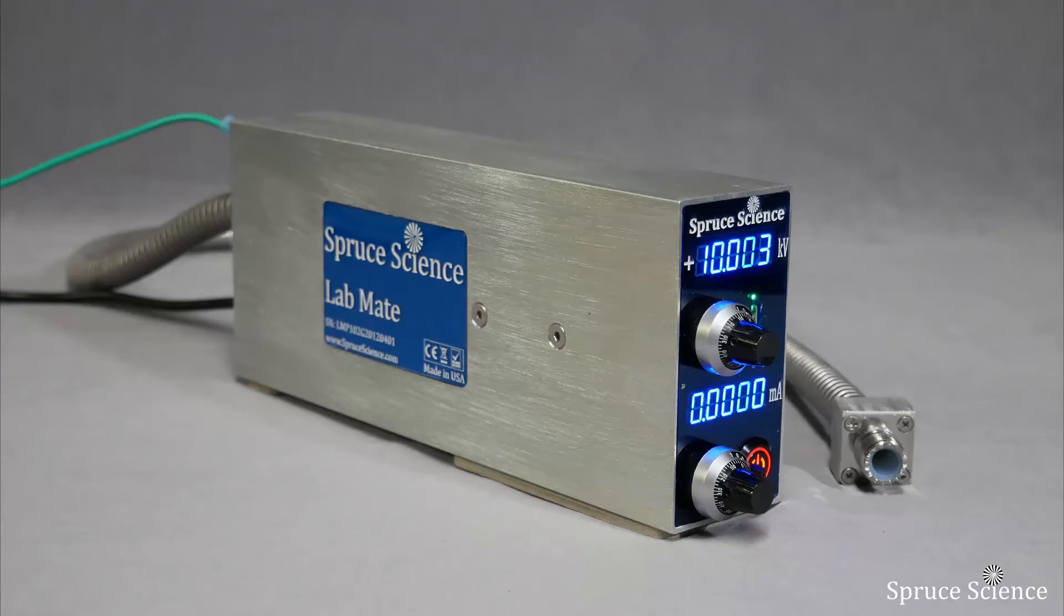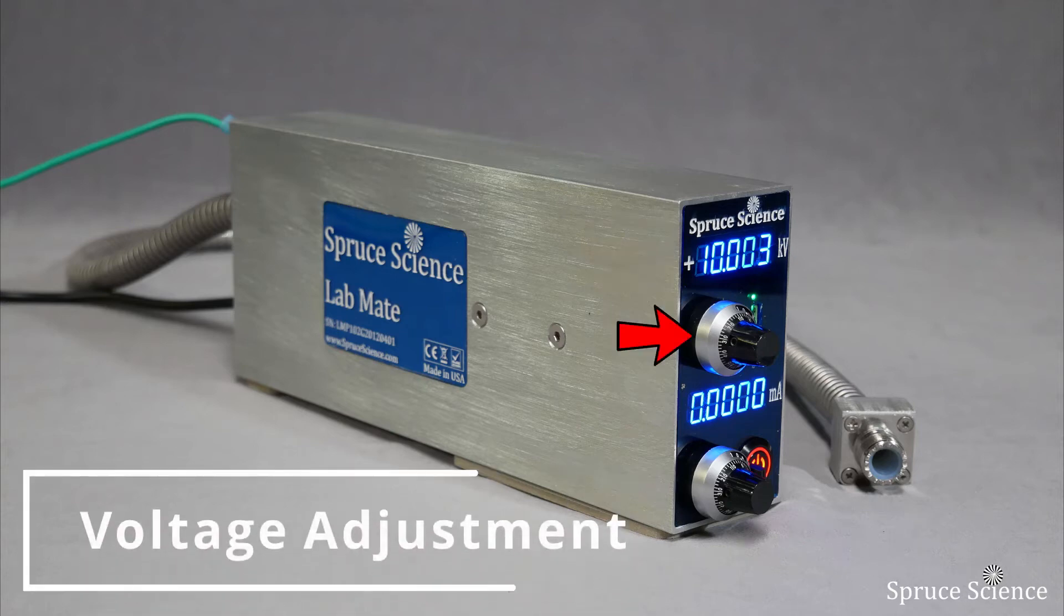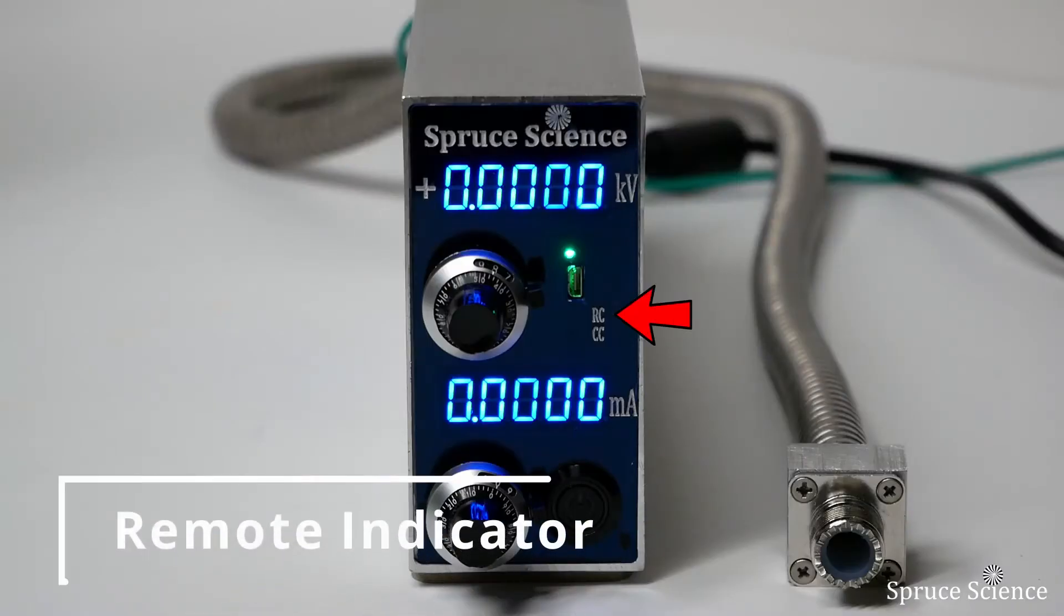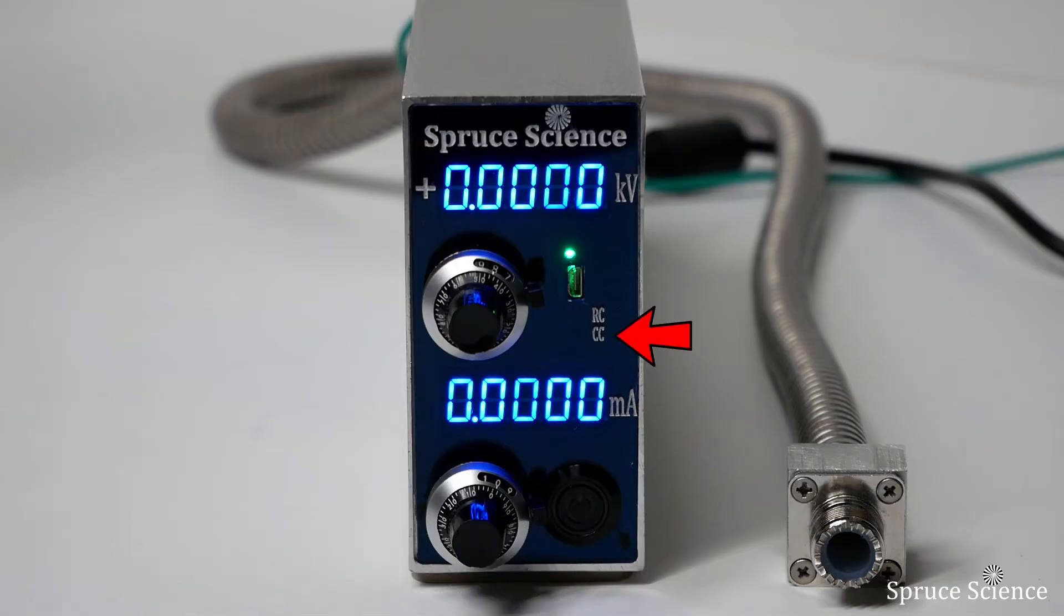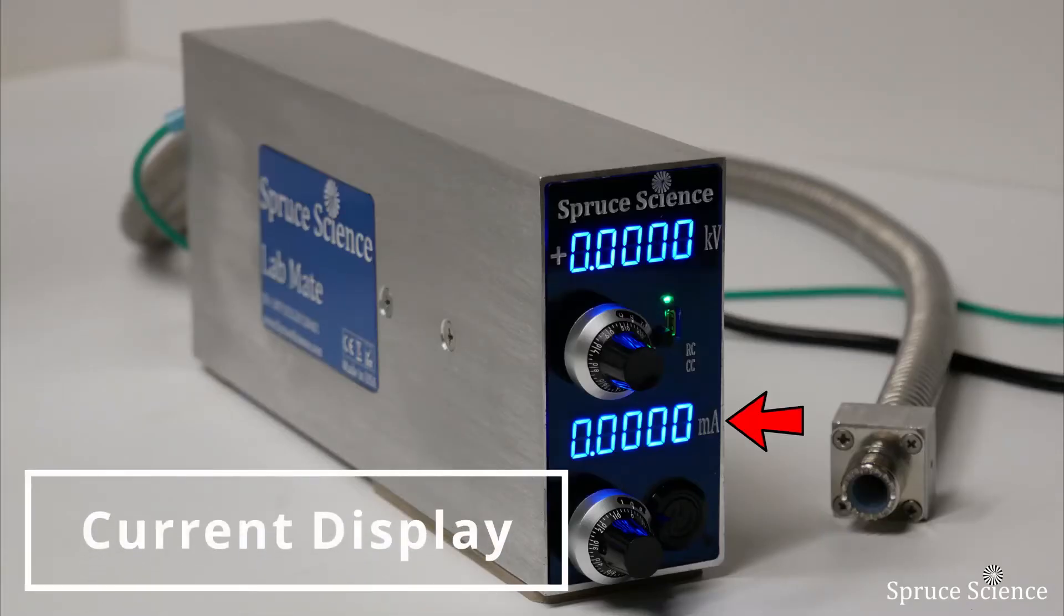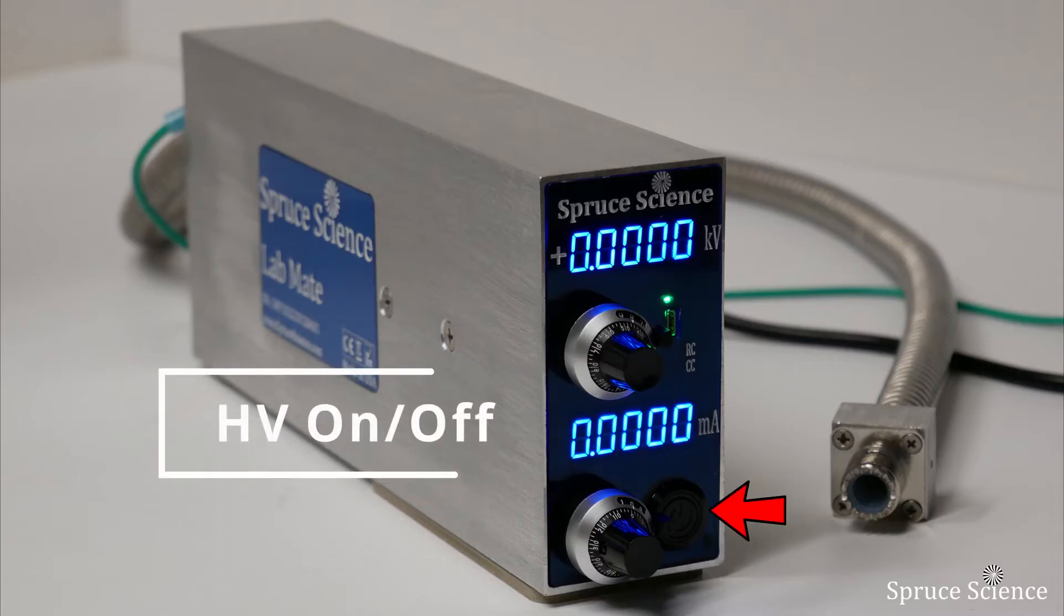Your front panel controls for the generator are as follows: voltage displayed in five digits, voltage adjustment dial with turn counting indicator, remote control receptacle, indicator light when the unit is under remote control, indicator light when output is in constant current mode, current display, current adjustment dial, and high voltage on-off switch.